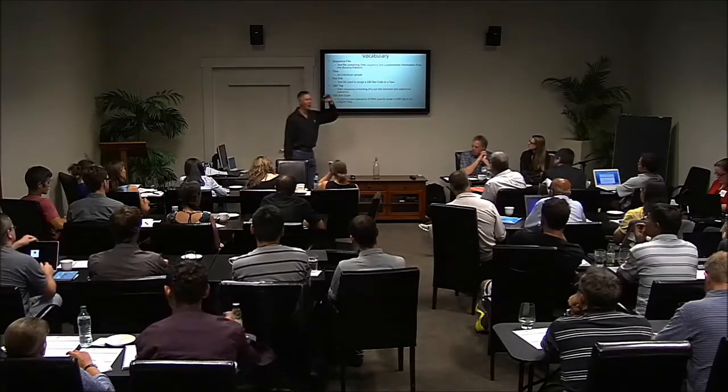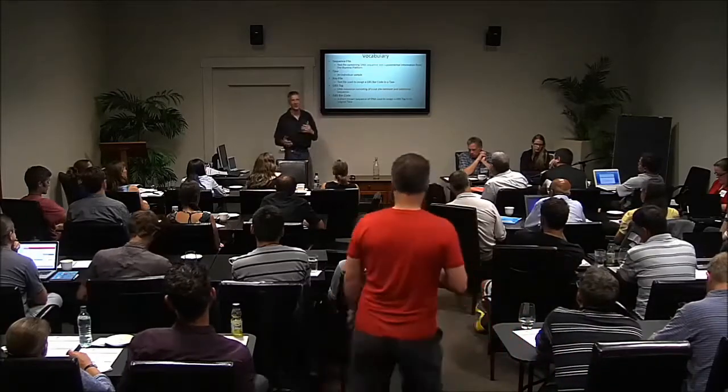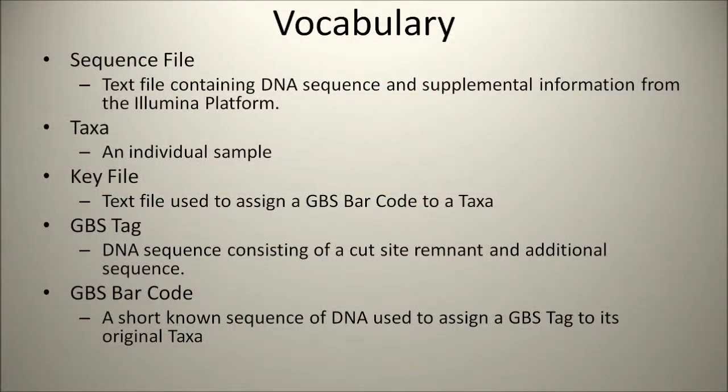Okay, so I want to talk about vocabulary here, and it's always useful to speak the same language. Part of the reason I've asked some molecular biologists, some geneticists, and some bioinformaticians or analysts to be in the same room is that part of the goal of this workshop is that we start developing some common vocabulary so we can talk to each other in a meaningful way about what we're trying to do here. So this is basic GBS vocabulary and beyond. A sequence file is just a text file, and it contains the DNA sequence and supplemental information. In our case, we're using the Illumina platform, so it's specific to the Illumina platform.